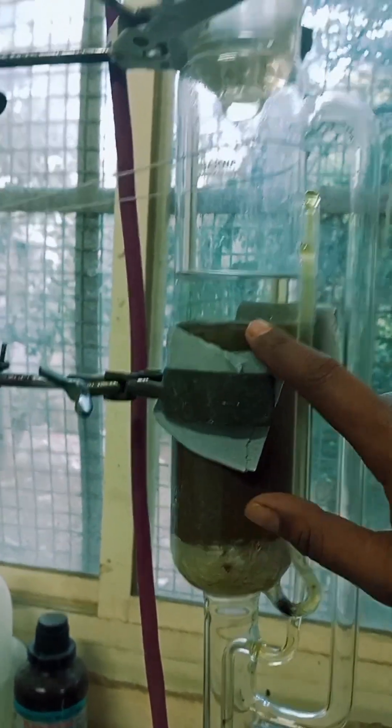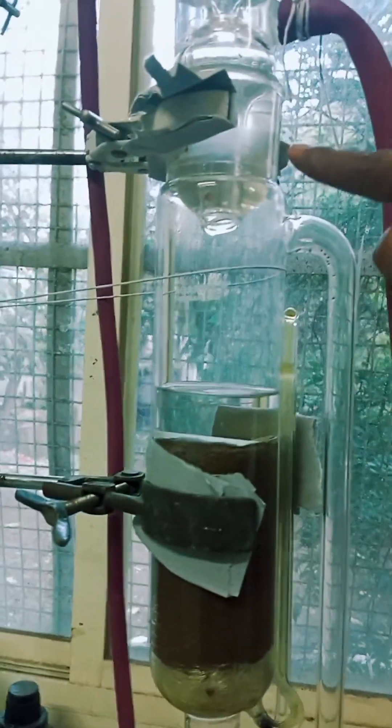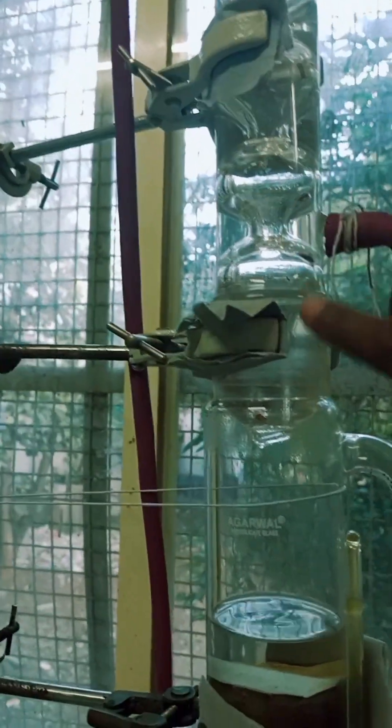This is called the siphon tube of the extraction chamber. Above the extraction chamber, there is the condenser. The condenser is connected with the help of petroleum sealing.